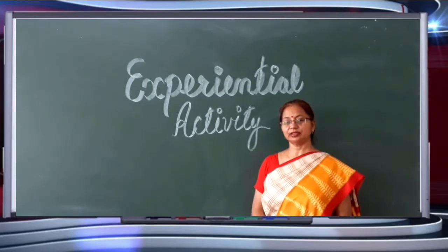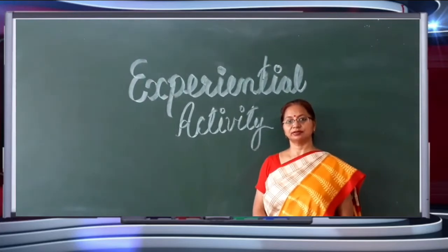Welcome to Experiential Activity. In this activity, students, we are going to study the texture and pH of soil which are collected from two different sites. Let's see what all we need for this experiment.